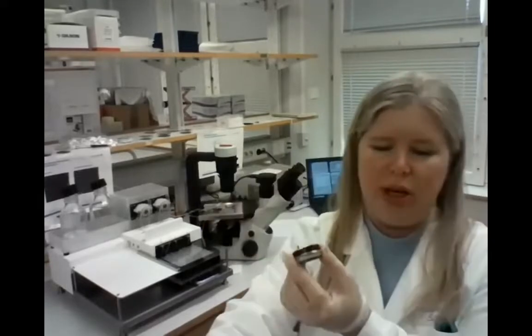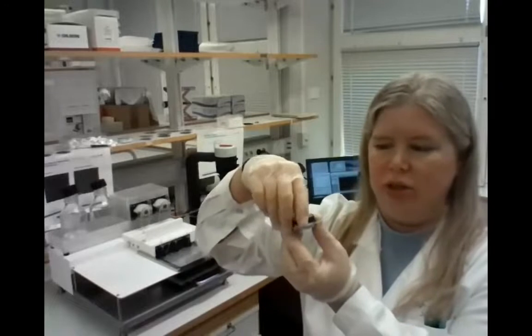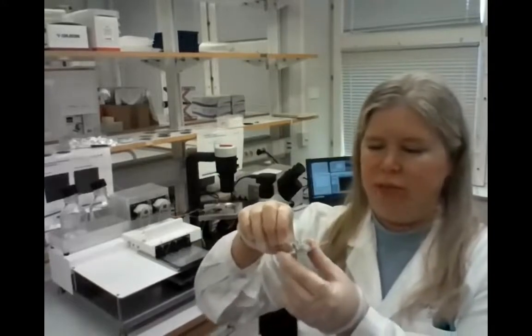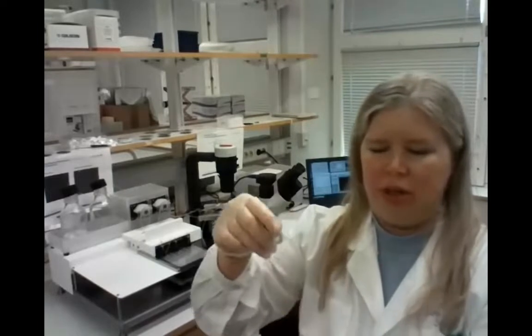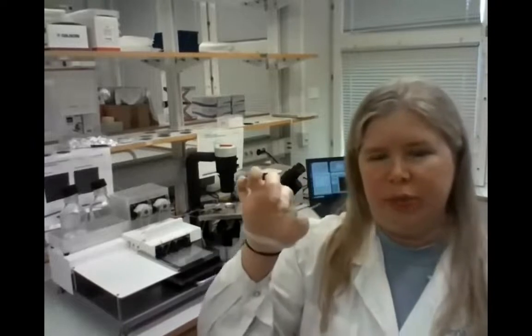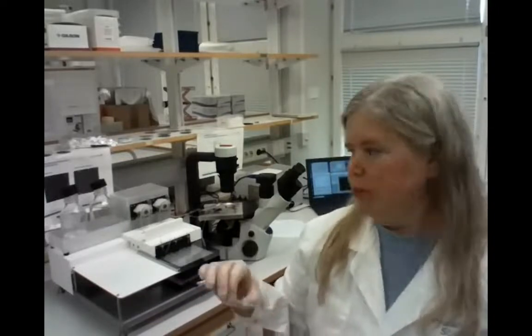Actually there could be undissolved particles left on the glass cover slip, depending on the properties of the tested formulation, and also some unabsorbed substance within the mucus simulant. This one you also save into a tube, and this will also be extracted and analyzed by LC-MS. So that is what happens next. You either have it in-house or you send it to a third party to analyze those samples.